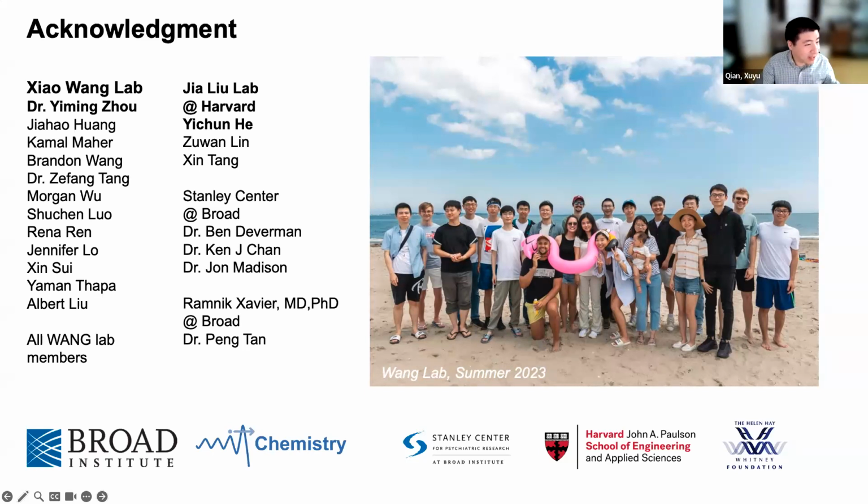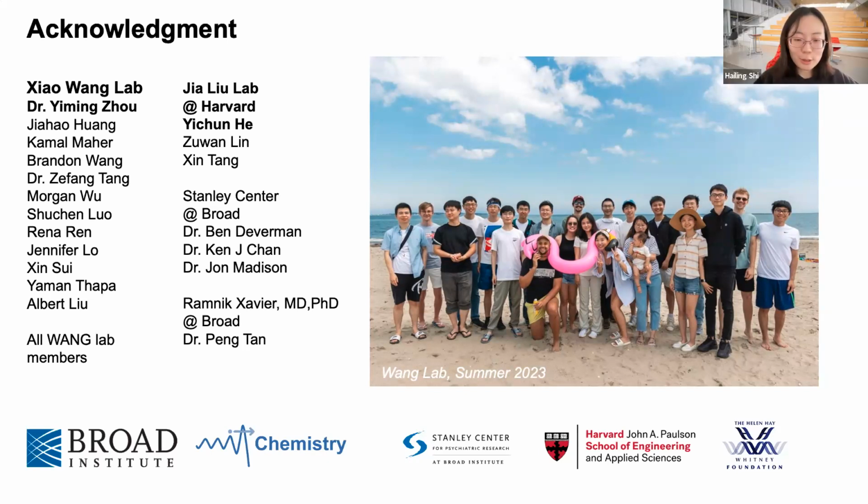Initially you used a set of targeted genes, about 1 to 1.1K, for your method. How did you decide which genes or how many to use in your method? Thanks for the question. Whenever you use a targeted approach, really the first big task is to determine what genes you want to include in this mapping. Let me go back to see if there's a useful slide for it.